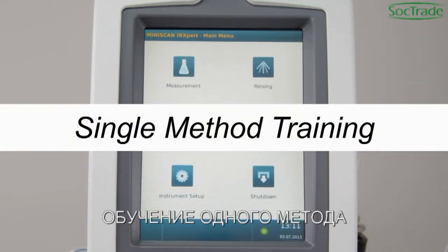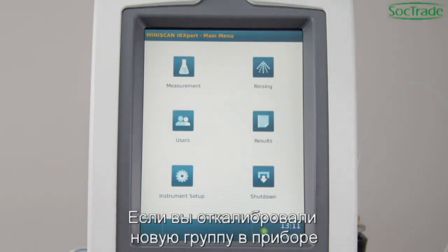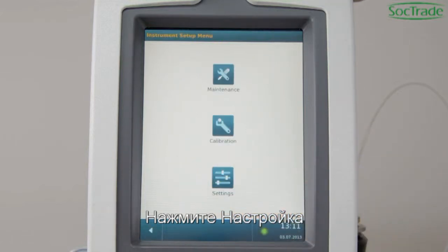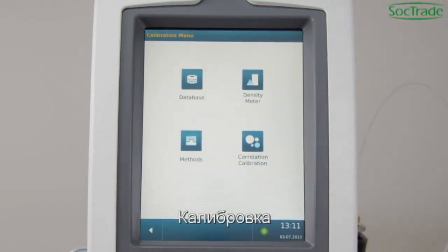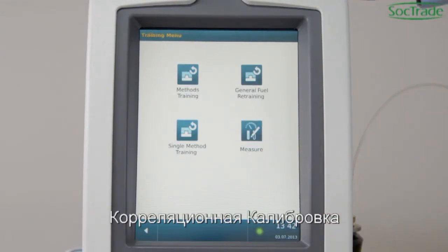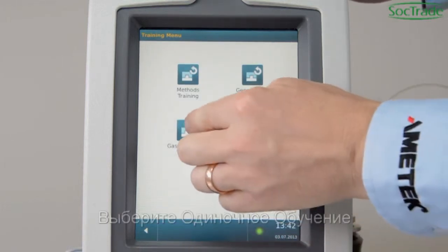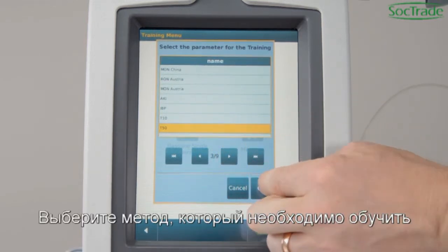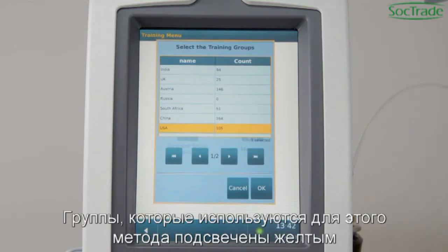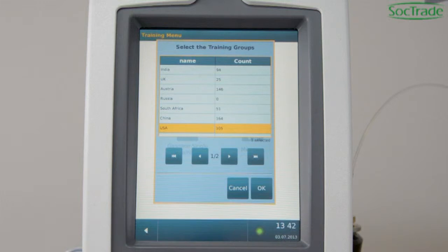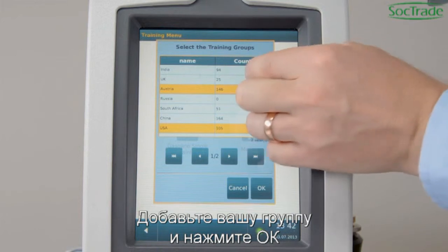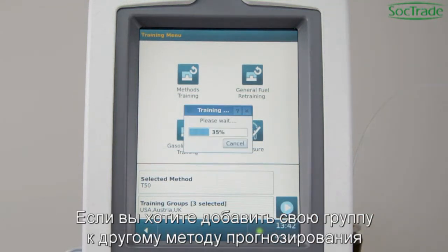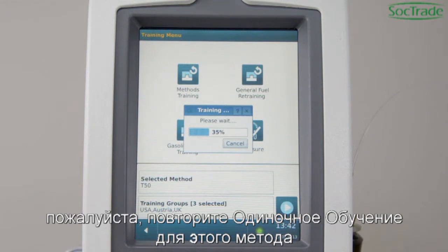Single Method Training. If you have calibrated a new fuel group into the instrument, start the Single Training to add the new fuel group to a prediction method. Go to Setup, enter Calibration, go to Correlation Calibration, and enter the fuel type. Select Single Training. Select the method to be trained. The groups used for this method are highlighted. Add your group and press OK. Then start the training procedure. If you want to add your fuel group to another predicted method, please repeat the Single Training for that method.